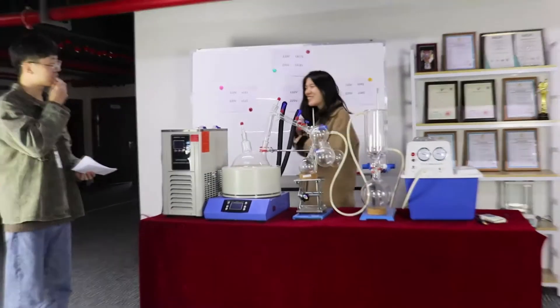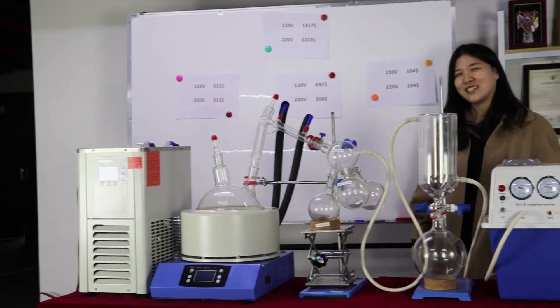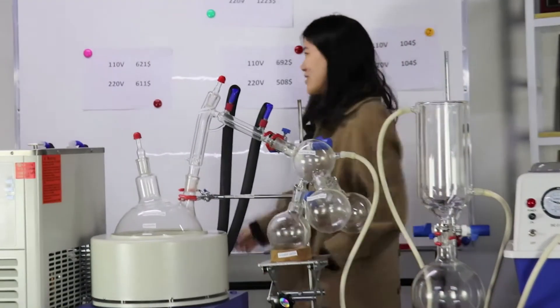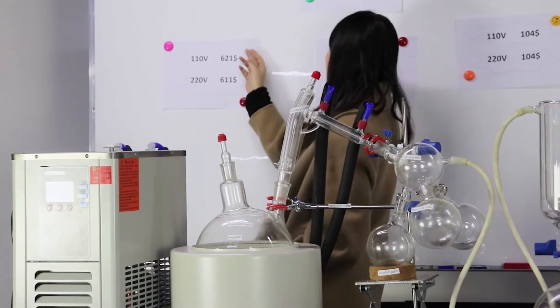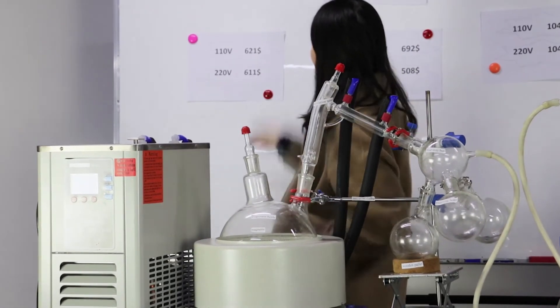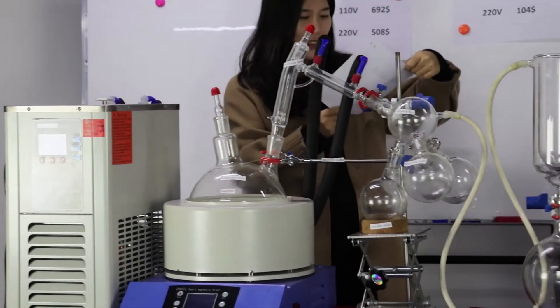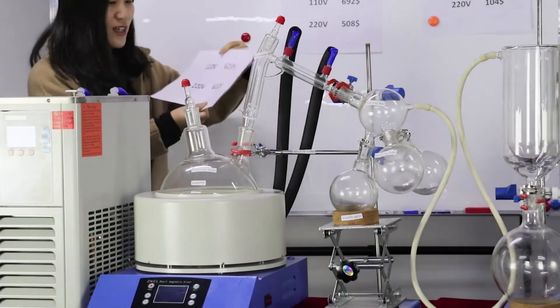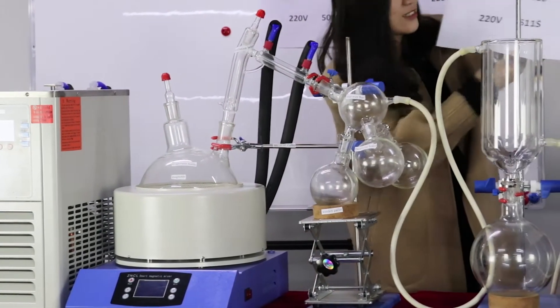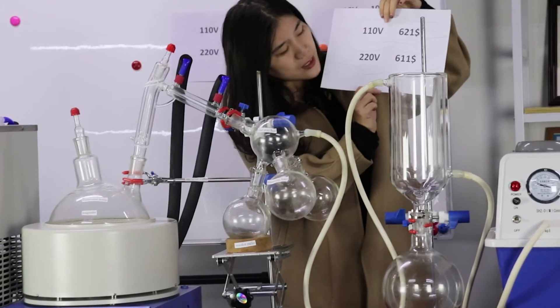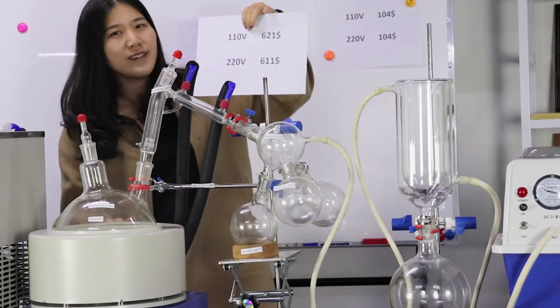Hi, I'm coming. Now let's come to the very exciting part. Yes, excited, because of the price. The price is very exciting. This is the chiller. Yes, the distillation system today just needs $1,611. Yes, $1,611.